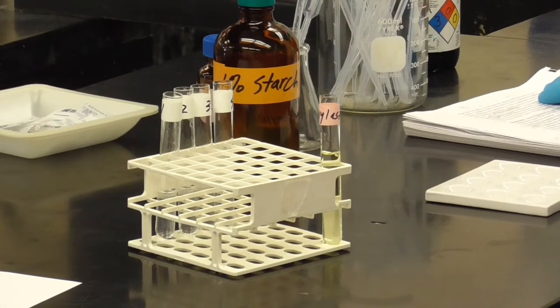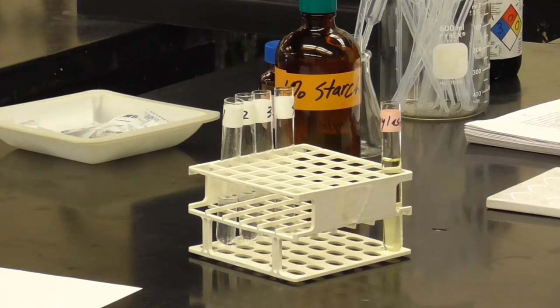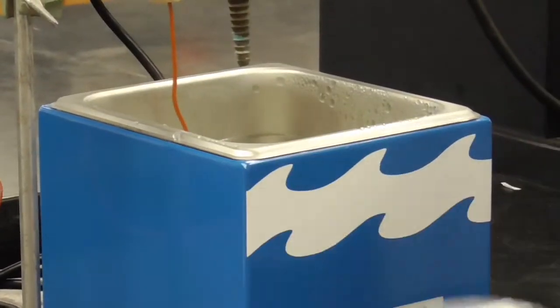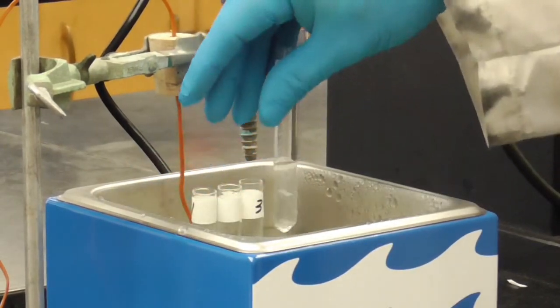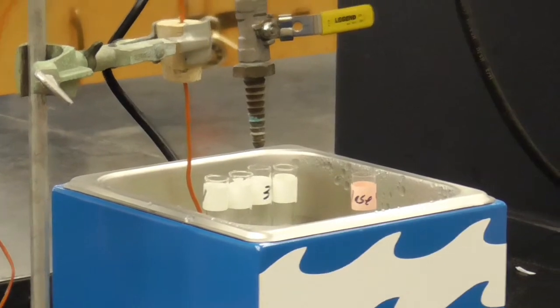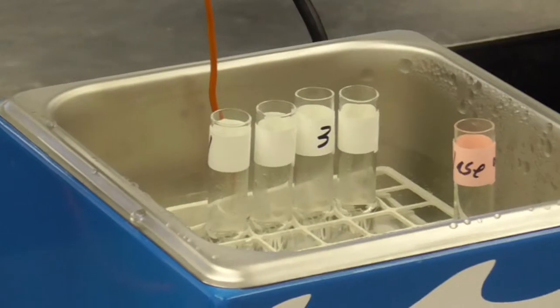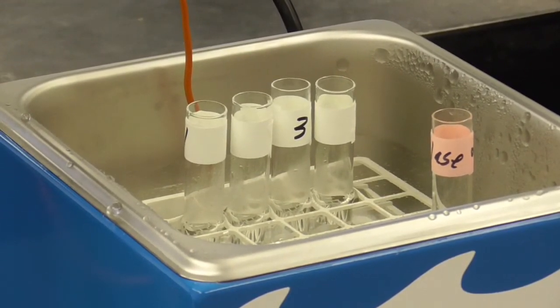Place all of those at 37 degrees in the water bath and wait for 5 minutes. So we're just trying to get them to come up to temperature. And so let's come over here. Here's my 37-degree water bath, and I have a test tube rack right in there. I don't know if you want to zoom in on that. That will allow them to come up to 37 degrees. It won't take very long, actually. They suggest 5 minutes in the protocol, so we'll give them a couple minutes.